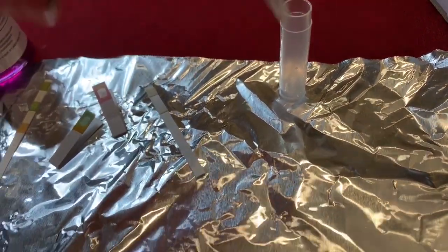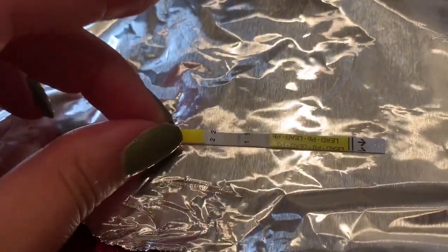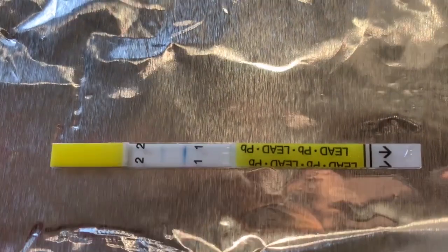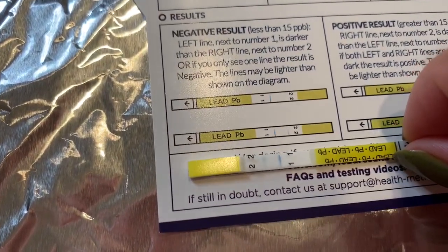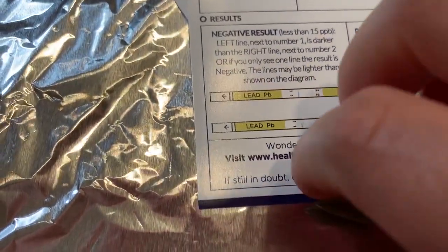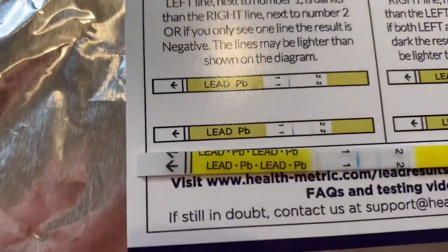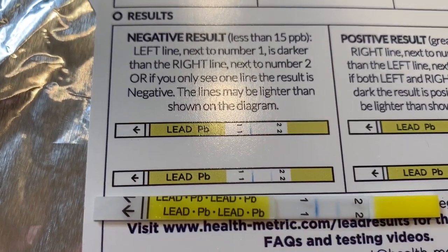Looks like the lead test is done. So now we can take it out and take a look at it. It looks like there is one line — a very faint line next to the two. So negative results, meaning it's less than 15. The line is very faint.